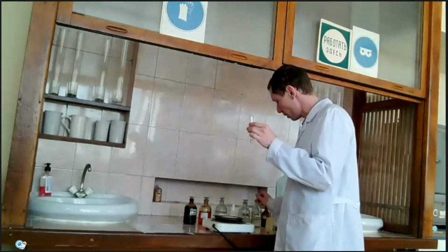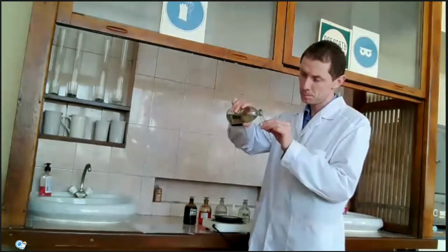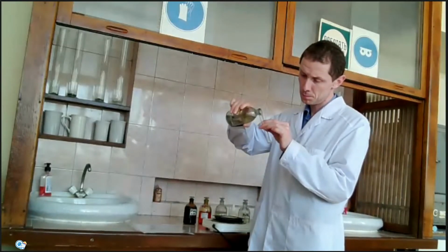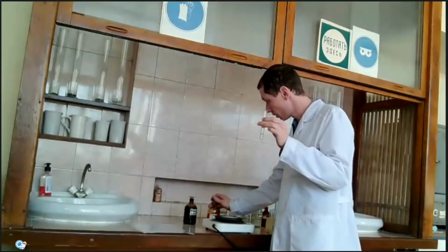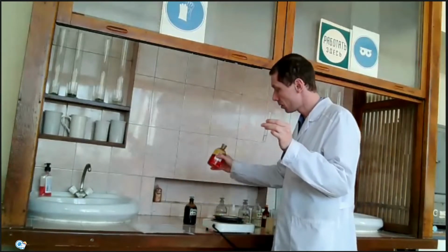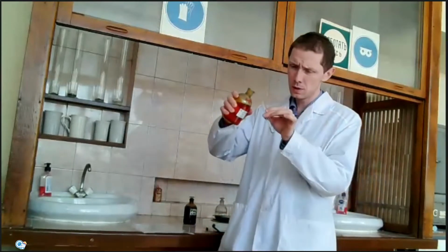Also in acid environment, so we will use a solution of sulfuric acid. And then we will add potassium bichromate.